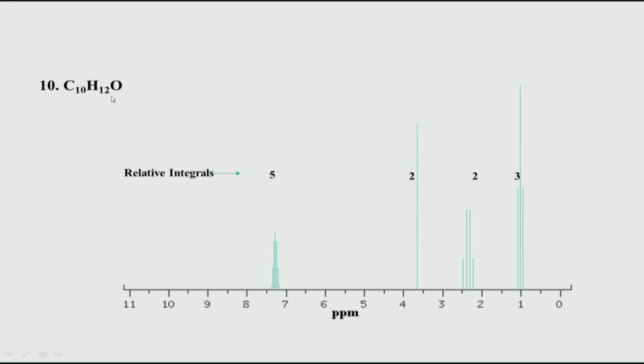But now there is an oxygen group here, which earlier was not there, and that probably is causing this downfield shift. Okay. So, what basically is happening is that there is a CH2 because there is a 2 now, this is not a methyl. So, there is an isolated CH2 which is attached to an oxygen. Okay. That is what is interesting, that there is an isolated group, and in this particular case here, you see a triplet and a quartet.